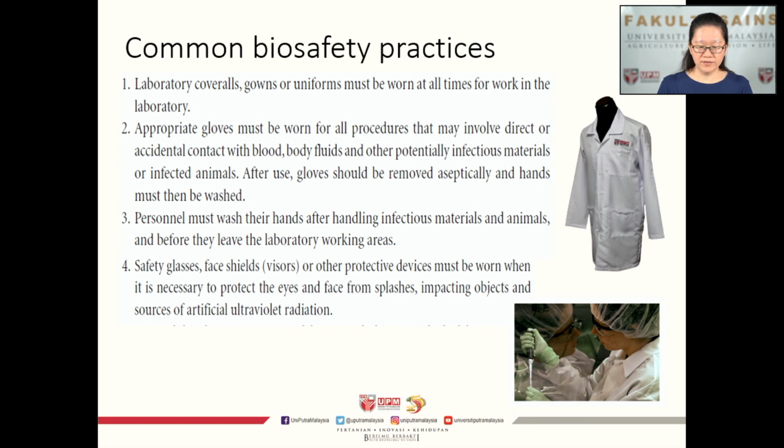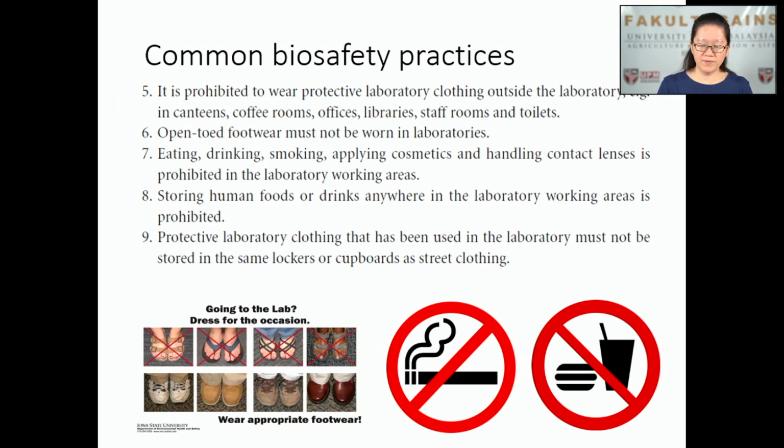Safety glasses, face shields and other protective devices must be worn when necessary to protect the eyes and face from splashes, impacting objects, and sources of artificial ultraviolet radiation. It is also prohibited to wear protective laboratory clothing outside the lab, for example in the canteen, coffee rooms, office, library, staff rooms, and toilet. Open-toe footwear must not be worn in the laboratory. Eating, drinking, smoking, applying cosmetics, or handling contact lenses is prohibited in the laboratory working area as well. Storing human food or drink anywhere in the laboratory area is also prohibited.